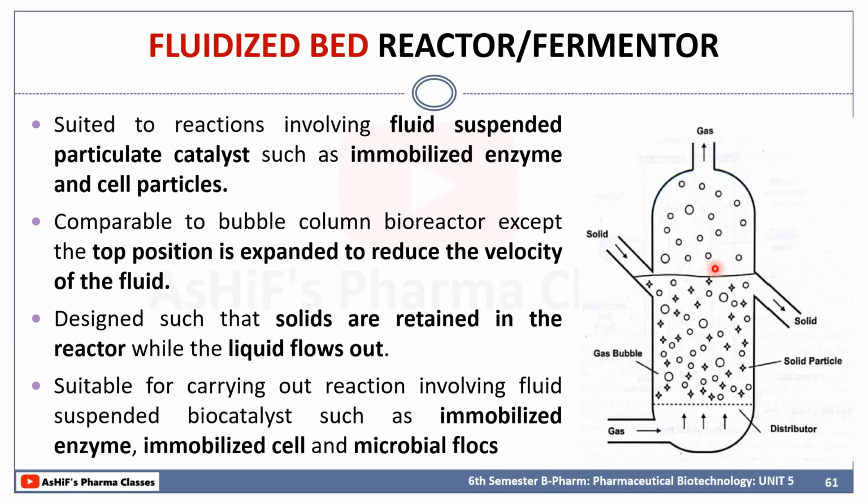So liquid flow will go out, and it is mainly used for carrying out reactions involving fluid suspended biocatalysts such as immobilized enzyme, immobilized cells, microbial floccules. So this is the fluidized bed fermenter.